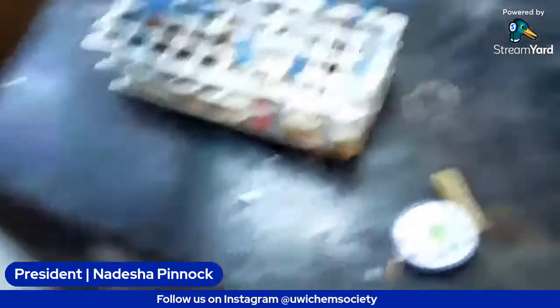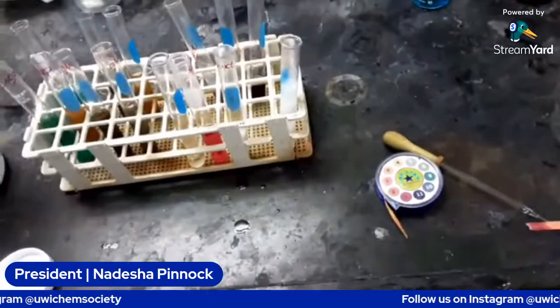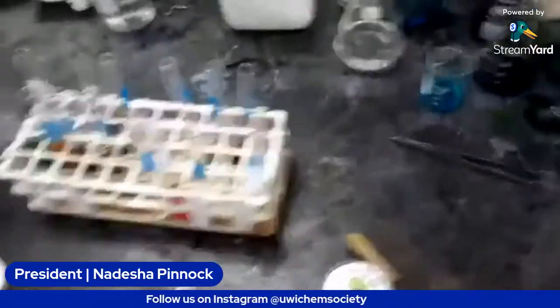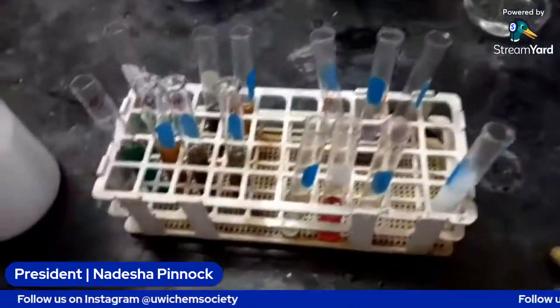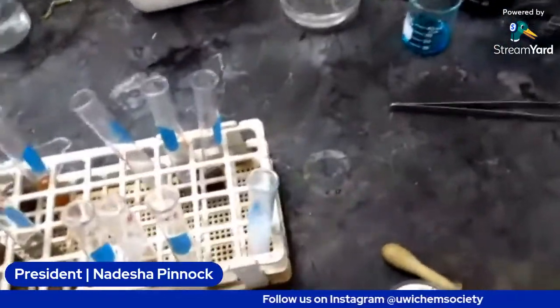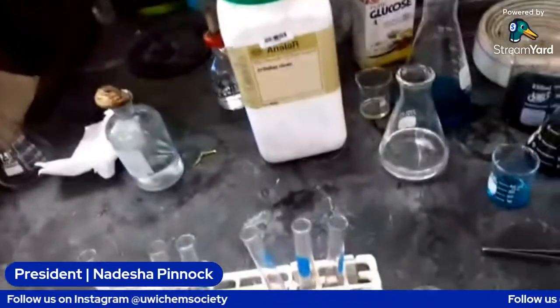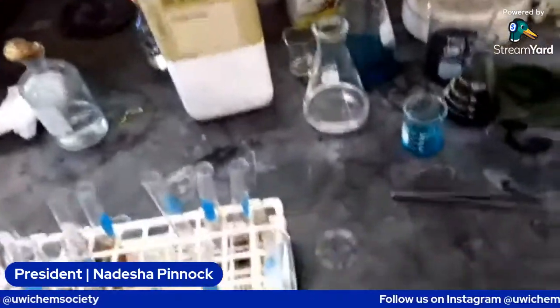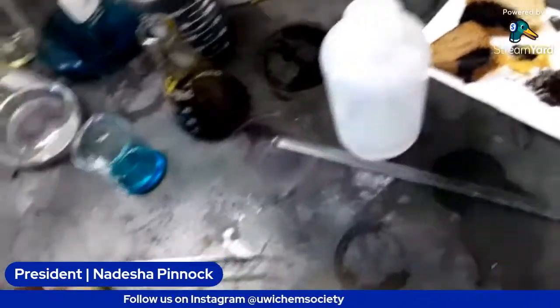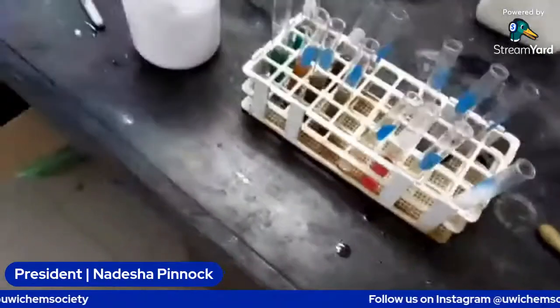So learning here: we're going to make the solution and add 2 to 3 drops of acid. That's what we're going to do, because we don't have all day to be doing this. You have to just put the liquid in there. I think it's probably because the acid was concentrated HCl.